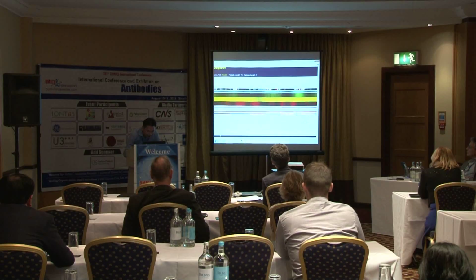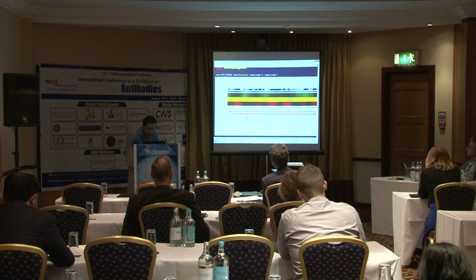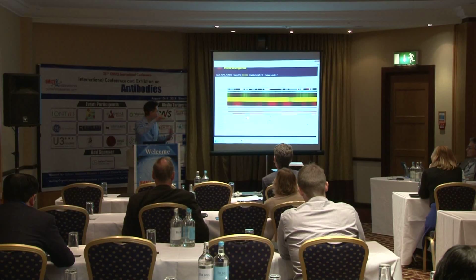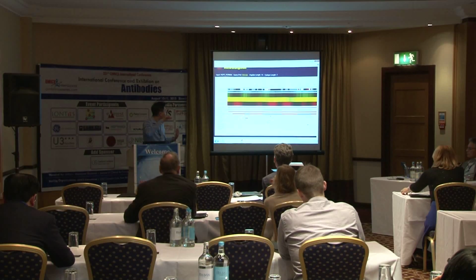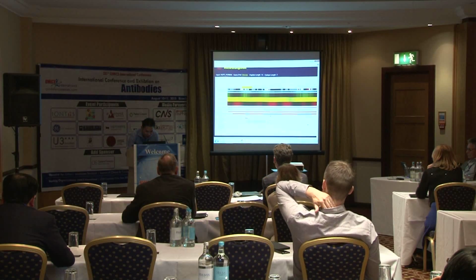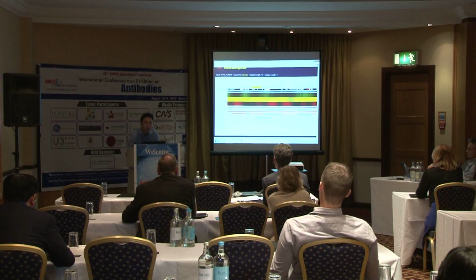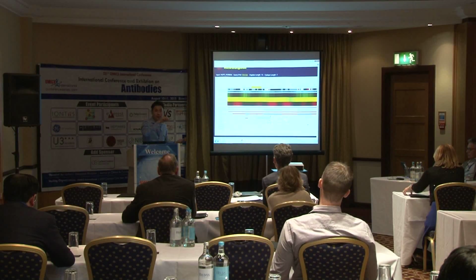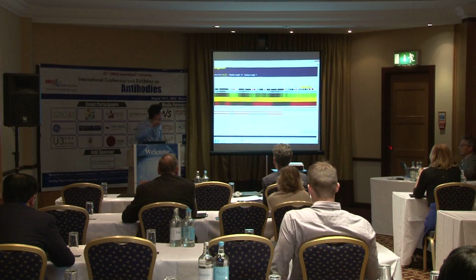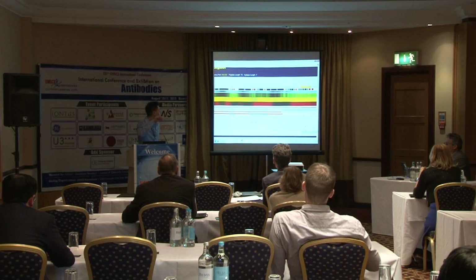And the rest down below is information that we extract from UniProt, basically. We make it interactive and easy to use, so you can mouse over, and it will tell you what has been annotated in the UniProt record. In this case, let's say that green area again at the C terminal, you can see that it has some phosphorylation here. Then if you don't like it, you can avoid it.